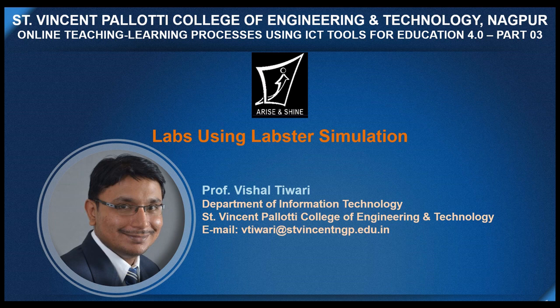Here we will look at how we can bring our students back to our labs. Due to this COVID-19, we cannot imagine our students coming into the lab and performing the required practicals. So, with the help of this Labster simulation, we will be in a position to make our students go through all the things that we are supposed to do. So, without wasting much time, we will start with the demonstration.